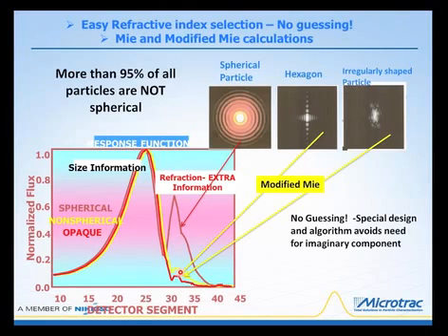So if we were to stay with the basic concept of using Mie scattering rather than realizing that irregular shaped particles actually have a different scattering phenomenon, then we would have to take this spherical calculation and somehow find a way to make it identical to this type of theory. So when we're asking for irregularly shaped particles, this is the type of thing that we're dealing with.